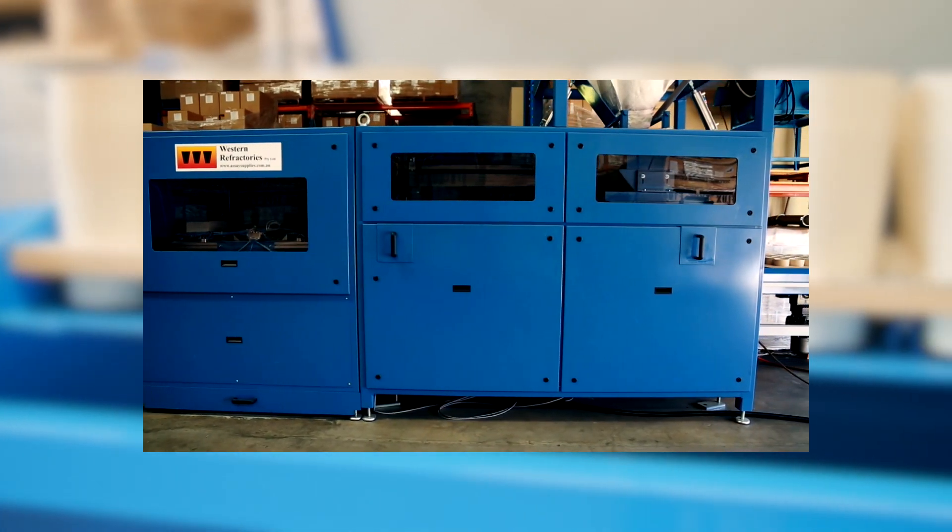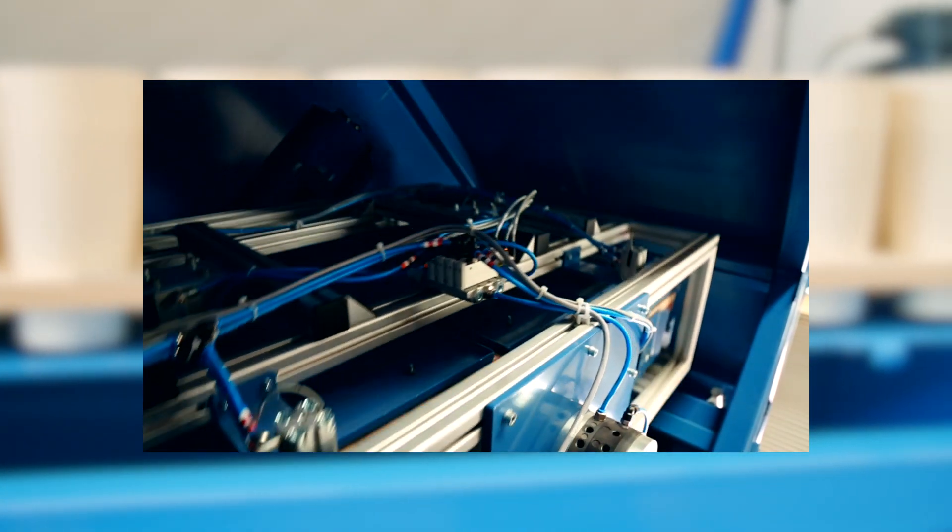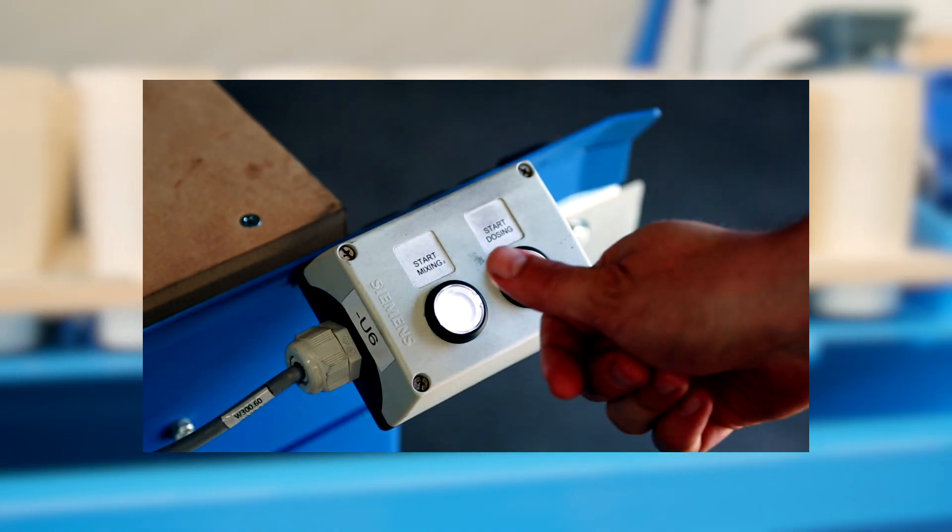Westref also has a new generation of dispensing and mixing technology available. The Quantum fluxing system has made the next leap forward in fire assay laboratory automation. Check out our video at this link.